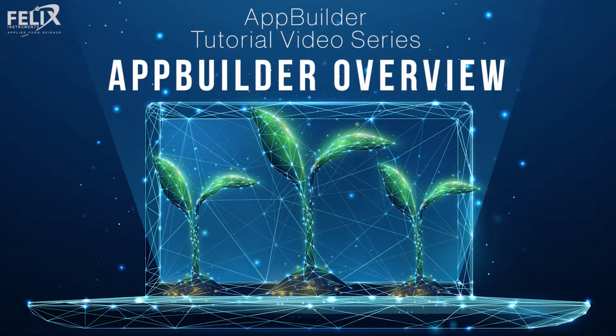The purpose of this video is to familiarize the user with the new AppBuilder software, and will include a brief overview of the menu structures and the various functionalities within AppBuilder.